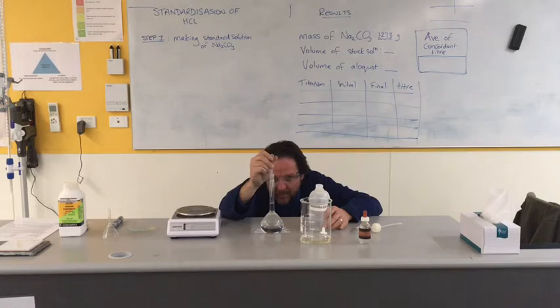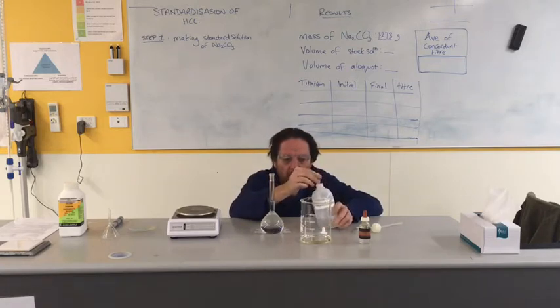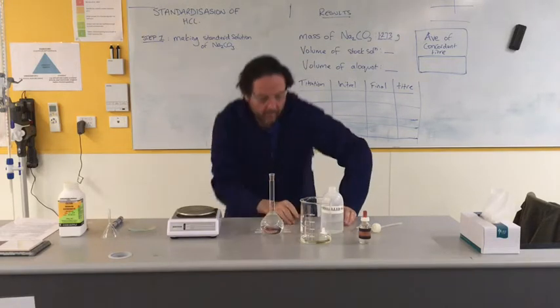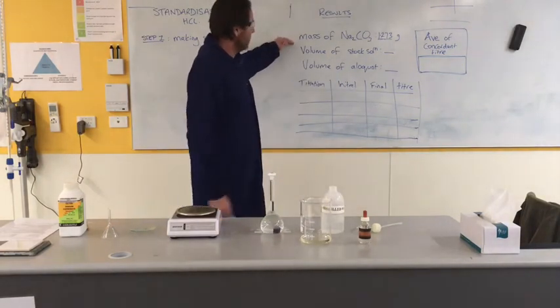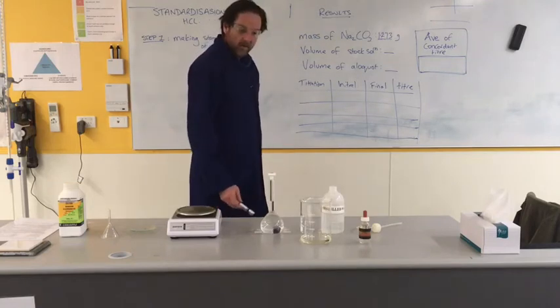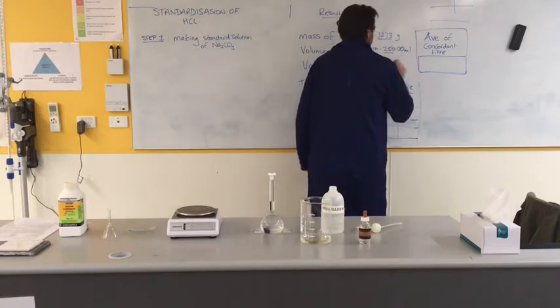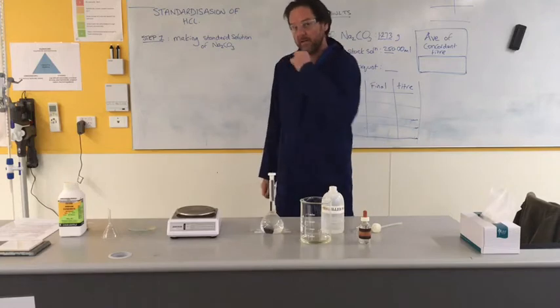I just want to watch that meniscus - keeping an eye on that meniscus. Let that drop or two away here. Bang on. That there is our standard solution of sodium carbonate. So just to check the results so far: the mass of the sodium carbonate is 1.273 grams, the volume of the stock solution was 250.00 ml. That is step one - we've now made a standard solution of base so that we can react it with the acid.